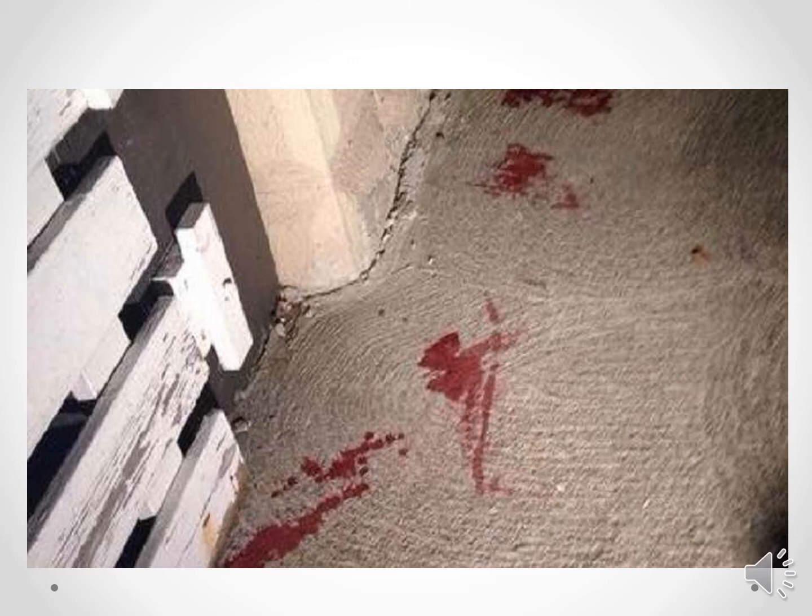In this picture, there is a red color. Is this blood? Maybe yes, maybe no. It may be blood or it may be anything that has a red color, such as strawberry juice or red sauce. So, how to identify the blood stain?